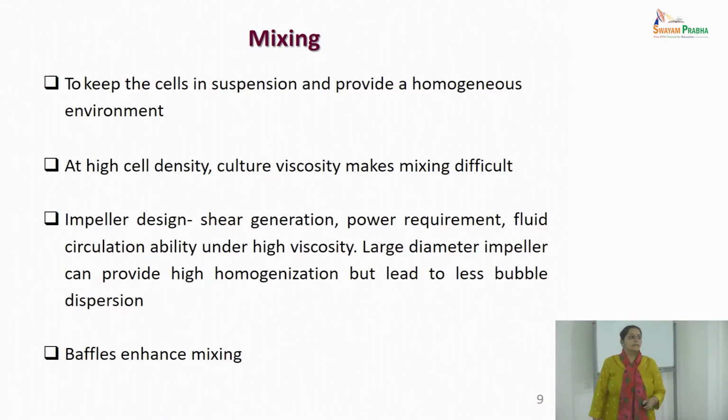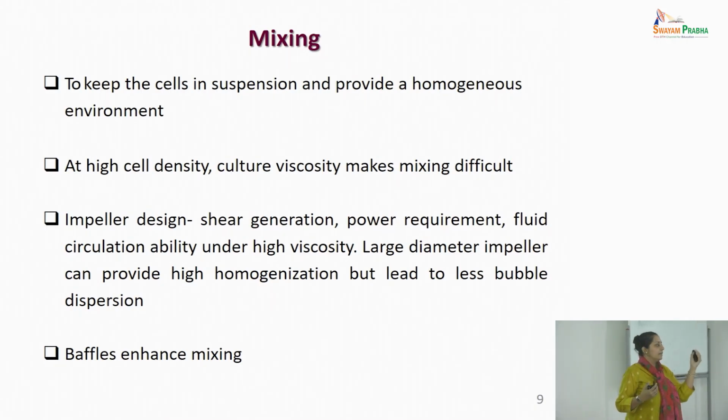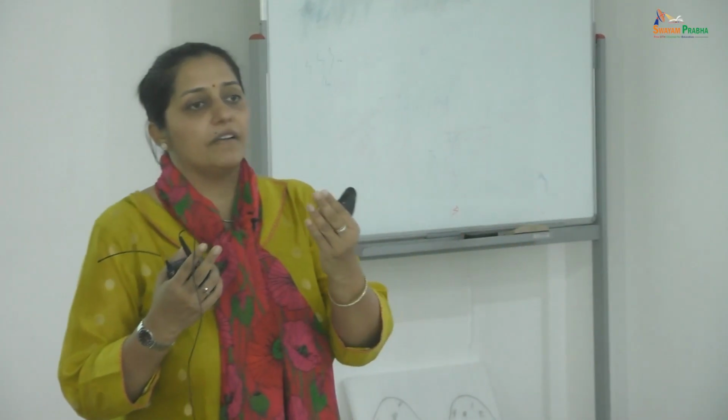Baffles are indeed stainless steel components, and they protrude out from the walls. So what happens during the circulation is that when the liquid hits the baffles, small eddies will form. And these eddies will not allow the biomass to settle on the walls.